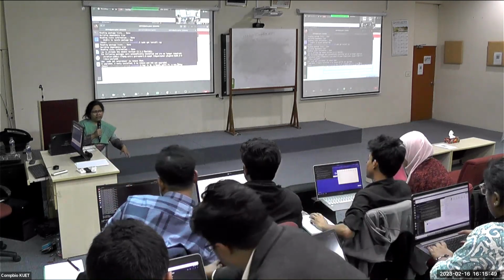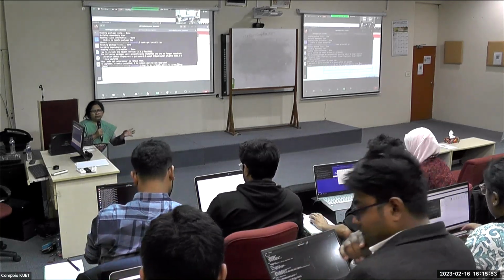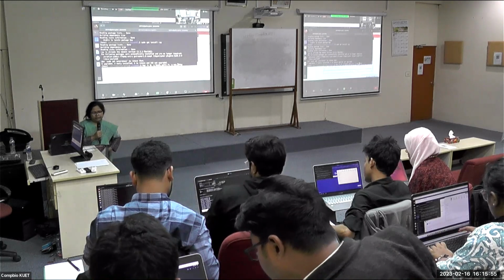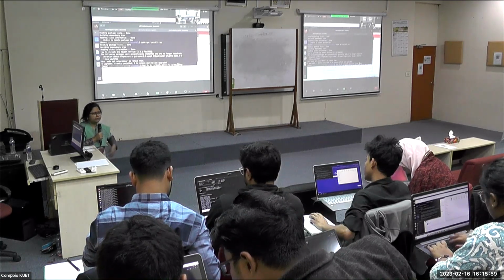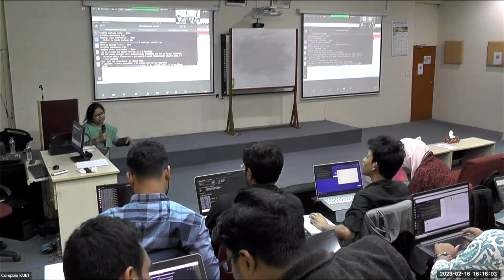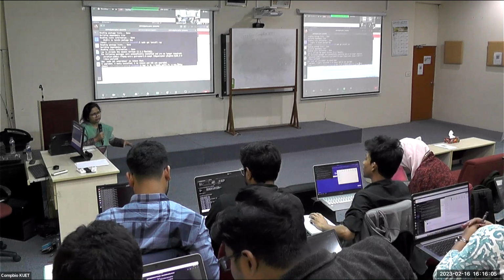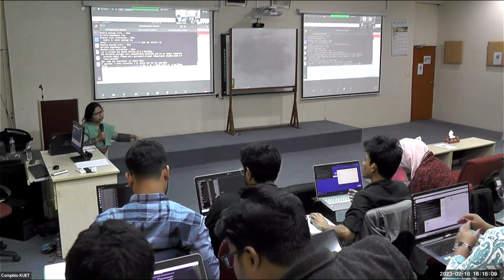So for now, I have provided it in the assembly folder, right? And from real-life problems, you will get the FASTQ files from the genome sequencer. You can convert it to FASTA, or you can use the FASTQ also. So we need to assemble those files, right?